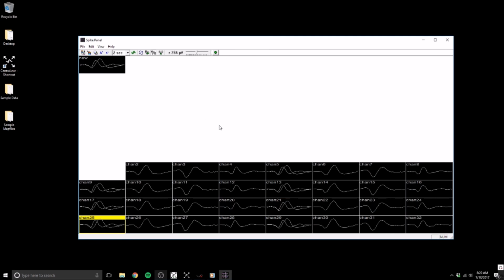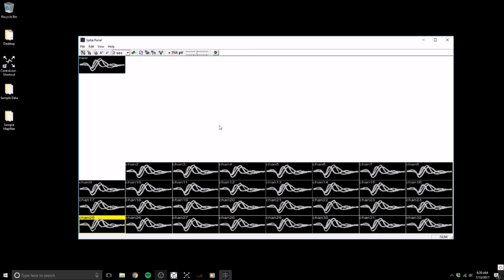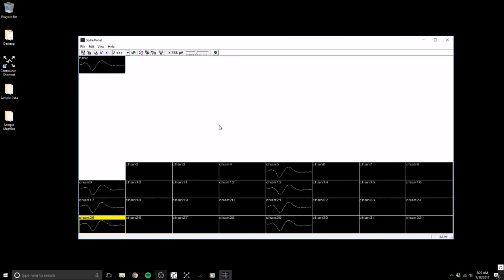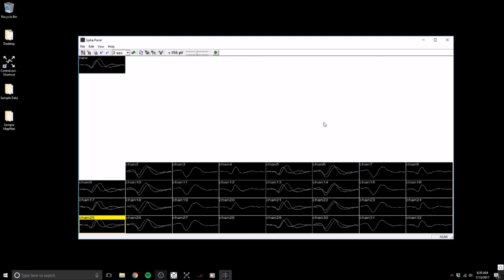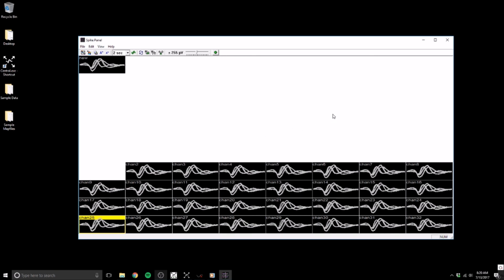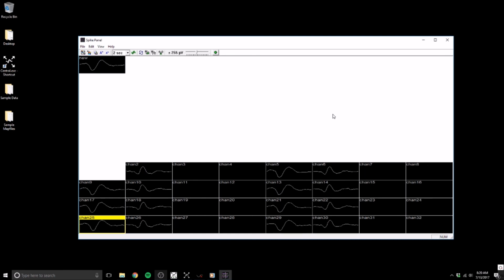This tutorial covers the basics of working with Mapfiles. We covered the purpose of Mapfiles, and we covered how to open, edit, and load them. This should allow you to make Mapfiles for your own electrodes and understand the purpose of the files that ship with your electrodes from Blackrock Microsystems.